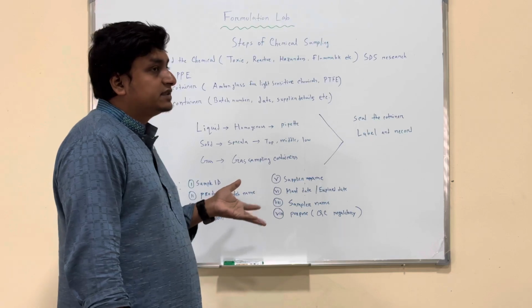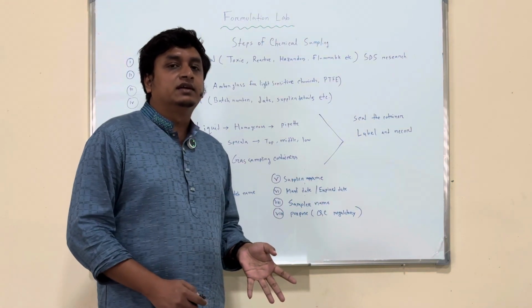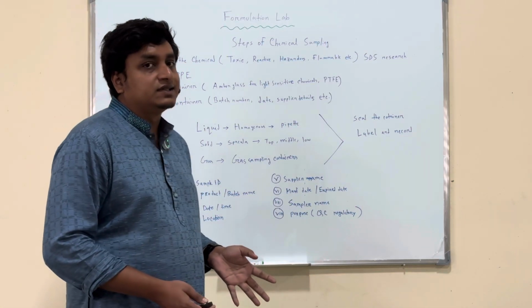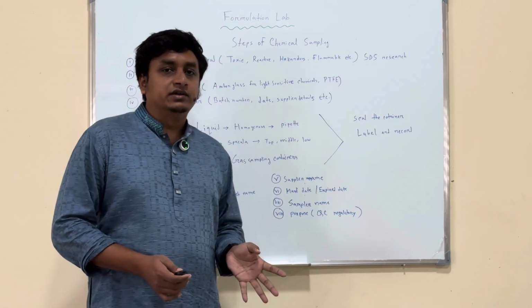So these are the common steps for sampling any kind of chemicals which we want to compare with our QC results and the COA of the chemicals.